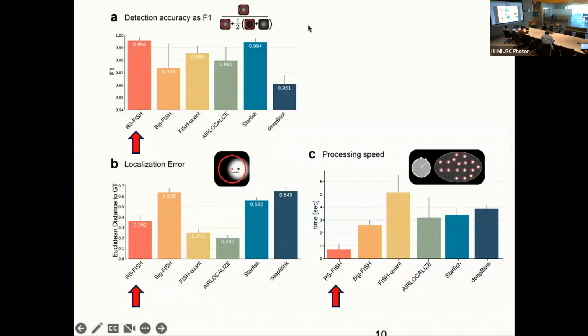The nice thing is it's pretty accurate. Honestly, they're all in the same range, with a little bit up and down. I also wrote this in the paper. A little bit better, but I think in the first revision we didn't even have this plot. People were pushing us, saying this is better, this is not better. It turned out to be a tiny bit better. But I think all of this is pretty comparable. I don't think it really matters.